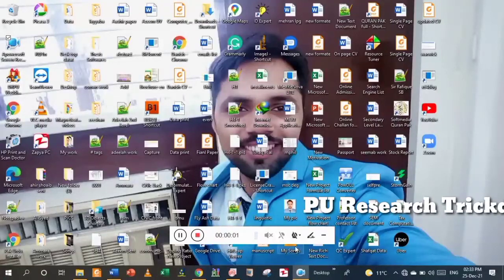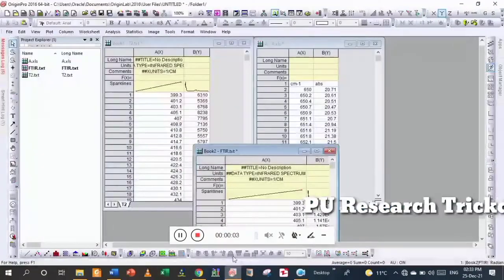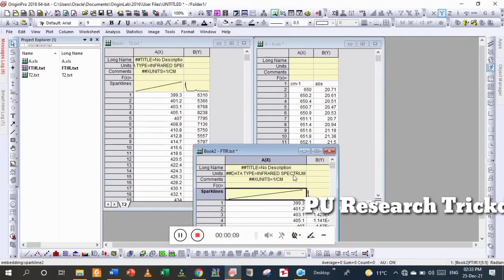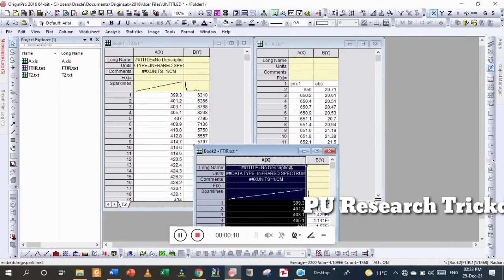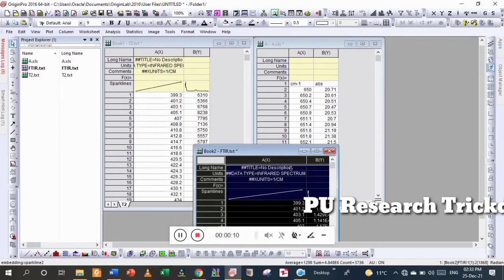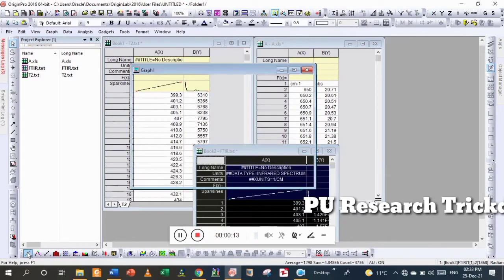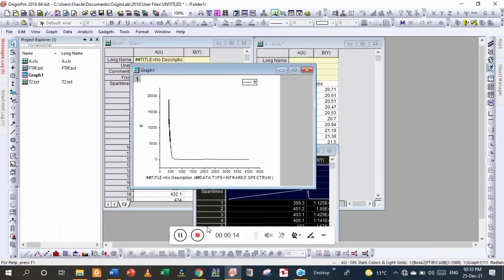Assalamu alaikum, hello viewers. Today we are going to learn about how to change absorbance data into transmittance data. We have three different samples and the graphs are different, so we are going to start.